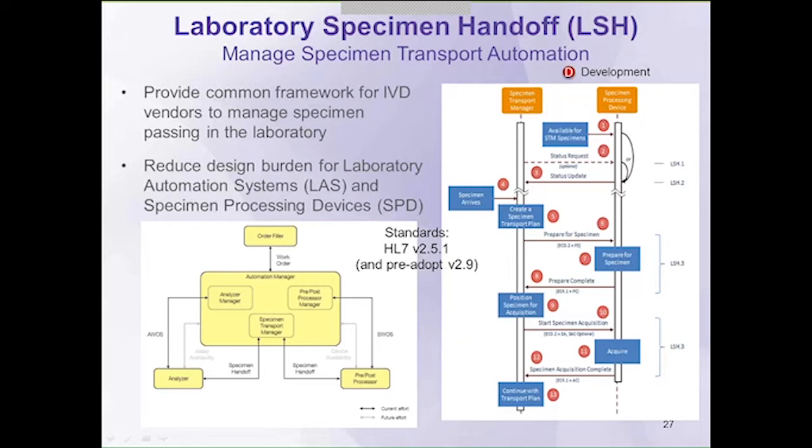And in the absence, of course, of any guidance, much of the specimen handoffs are implemented by various vended systems on an ad hoc basis, which means that every implementation at every site needs to implement a custom interaction.